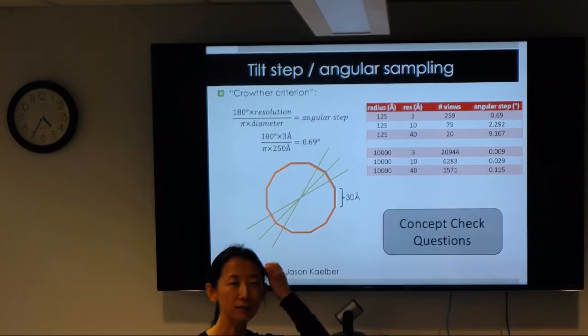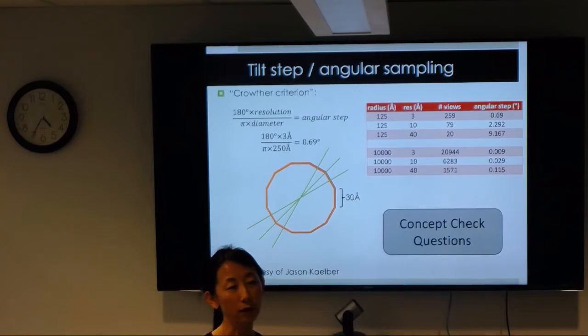I think years ago when people first started tomography, missing wedge was a very big concern in the field, and people were trying very hard to fix it. Subtomogram averaging started a lot later than tomography of your sample. So probably people were thinking dual axis was one solution to the missing wedge. But later on, people could do subtomogram averaging to compensate for missing wedge. And then also because of the splitting of the dose into 2 tilt series instead of 1, it's a balance.